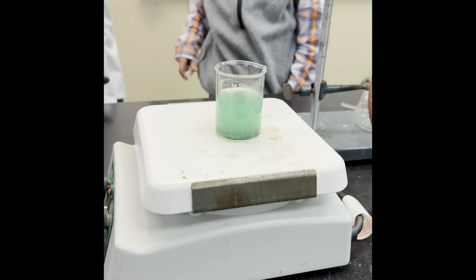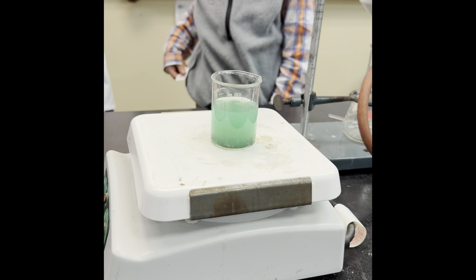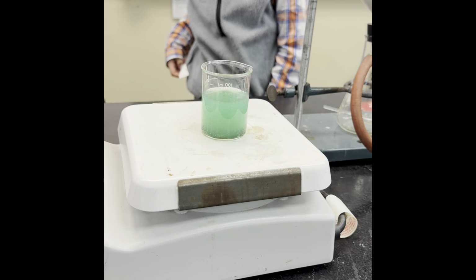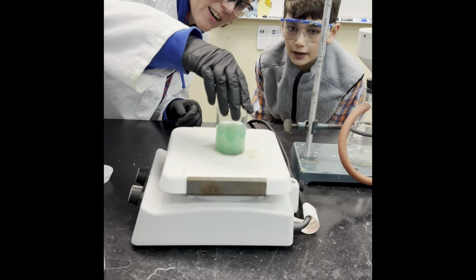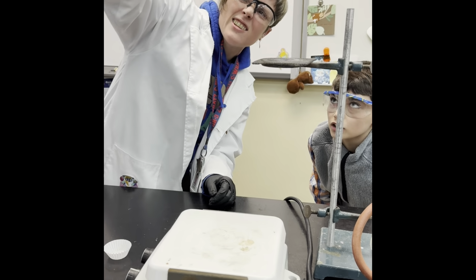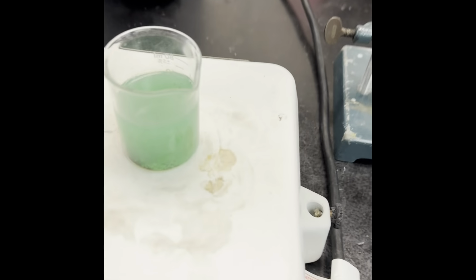It got a little bit more blurry at first, and now it's turning a little bit green, and I cannot see the iron anymore. Yeah, the iron has turned a weird color, like black, just full on black. Black. We'll see what it looks like when we isolate it.